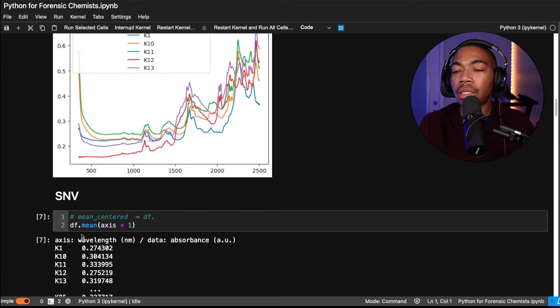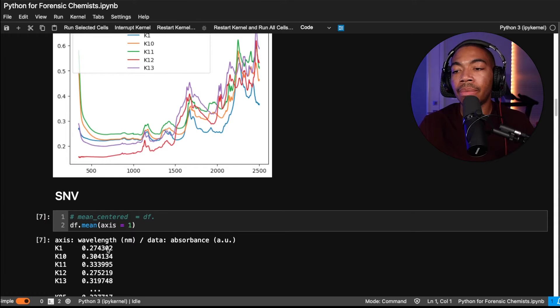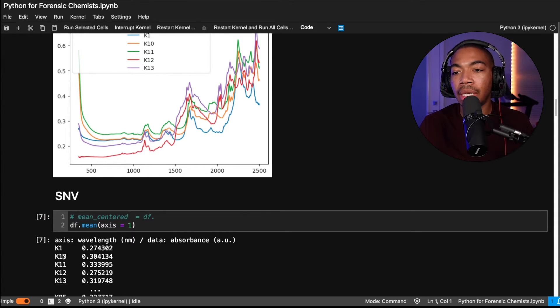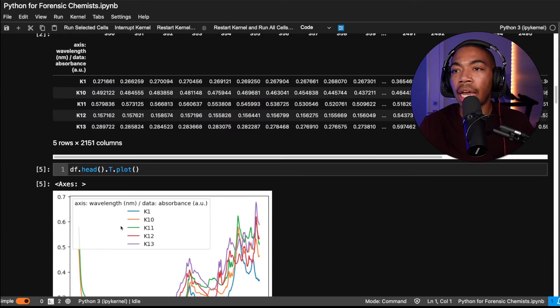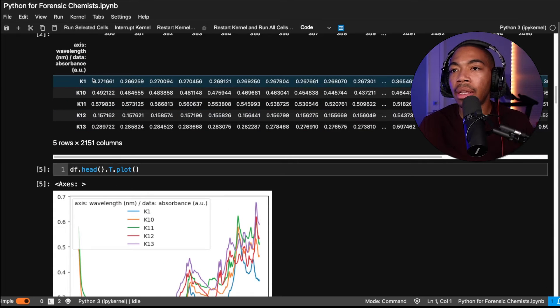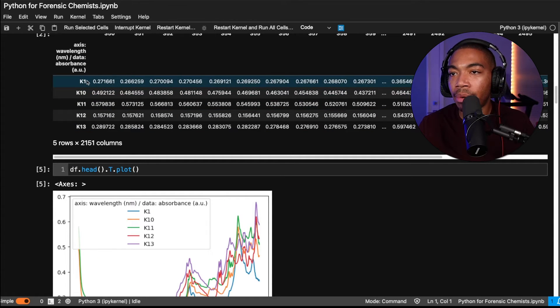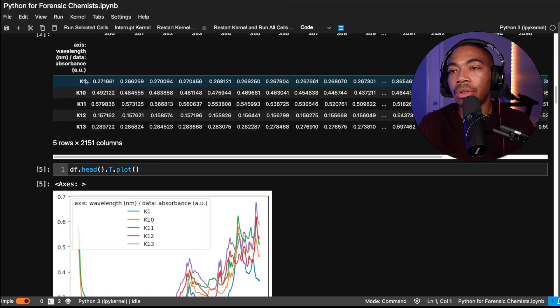What we want to do is set the axis equal to 1. And so what this does now is give us a mean absorbance value for k1, k10, k11, k12. So now we have a mean for this sample. That is how we're going to now mean center that sample.